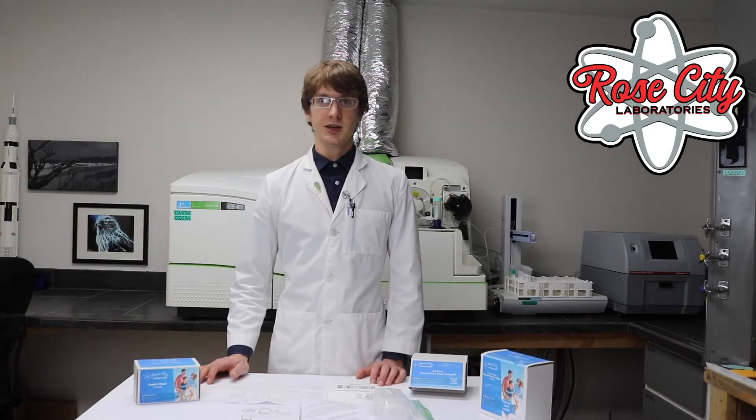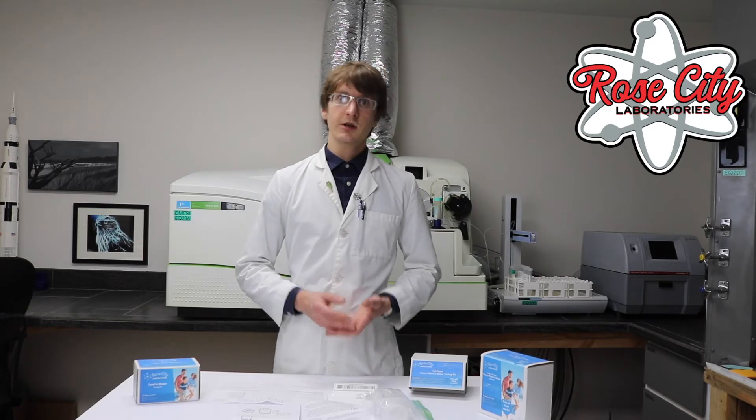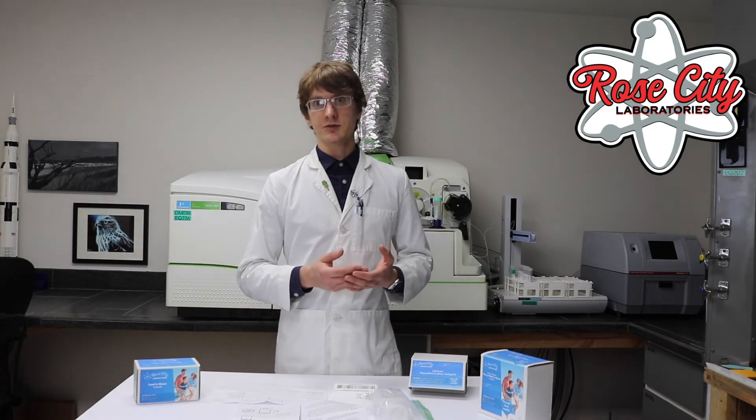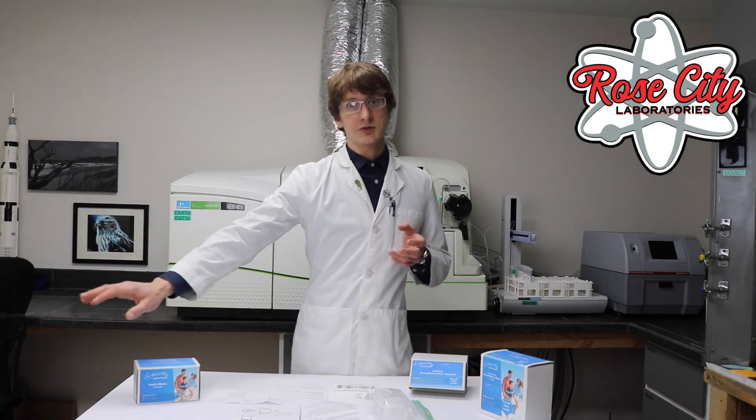One of the first things you'll need to decide is whether you want to do a first draw or a flush draw. First draw identifies lead and other metals that may be in the faucet, while flush draw identifies lead and metals that may be further downstream.